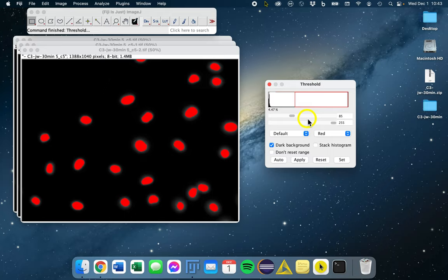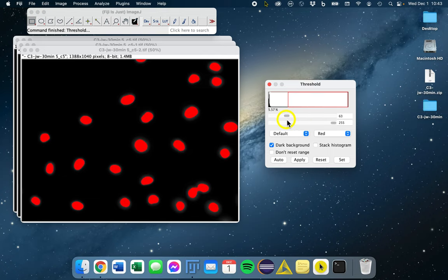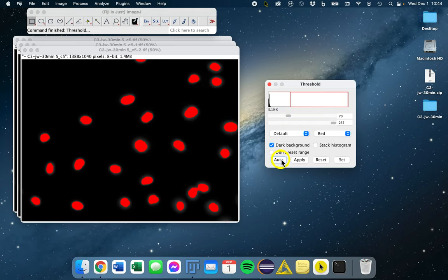It's better to use an auto thresholding method for reproducibility sake. You could introduce bias, and if you threshold each image in your analysis differently, that's not reproducible at all. So you want to use an auto method.